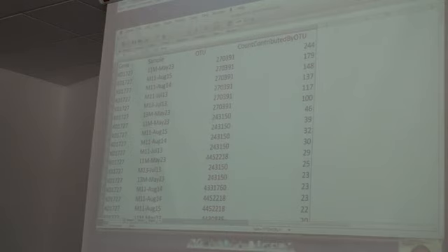So what you get out from this metagenome contributions tab delimited file is the gene ID that we've selected. And what I've done is I've just spread this into different spreadsheets for simplicity. Then you get the sample, and you get the OTU, and now we get the abundance information. So what this number means is that this OTU, with this Greengenes ID, contributed 244 of the functions associated with this in this sample.